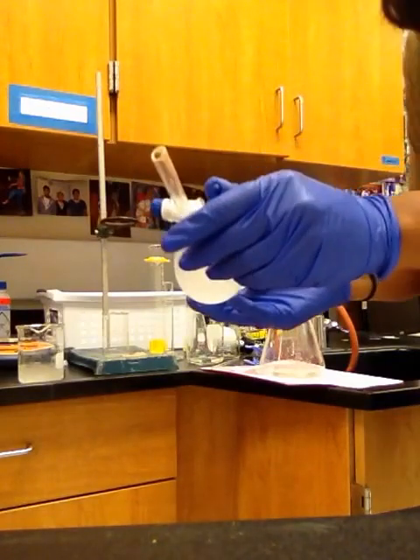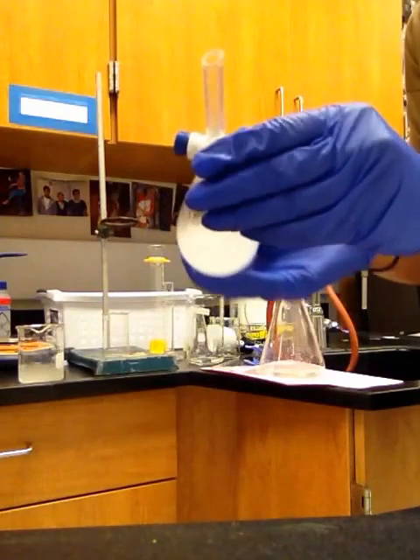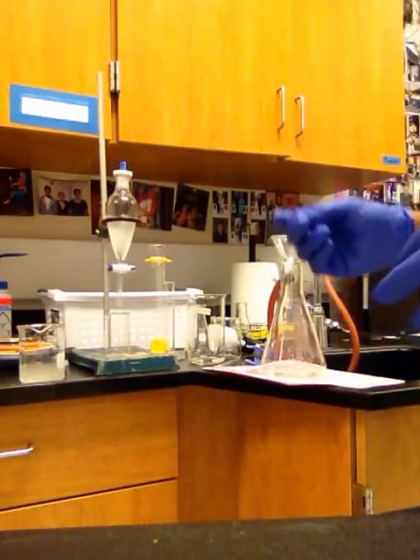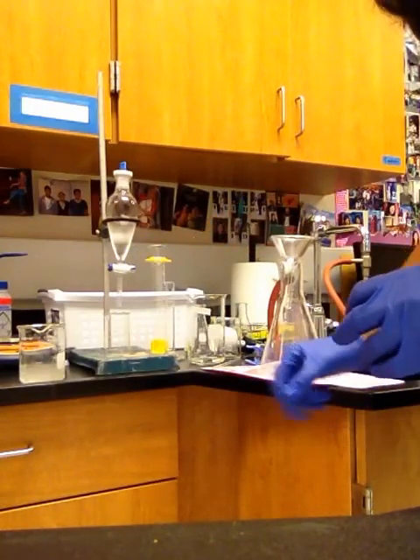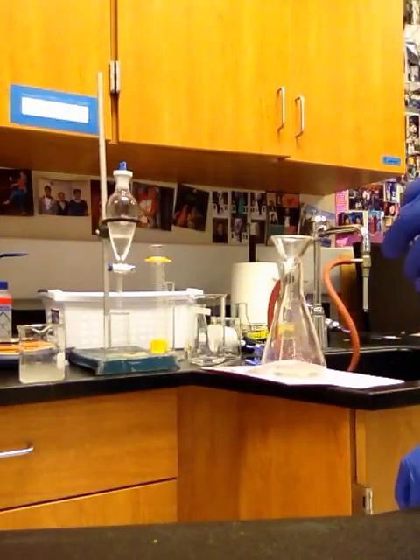Now we shake it really good, holding the top, and we release the gas. Let's shake it one more time, release the gas, and then let it stand. If there is aspirin contamination, at this time aspirin is going to move into the aqueous layer, which is the bottom layer. You can see it's starting to clear up, and the top layer is the ethyl acetate layer.